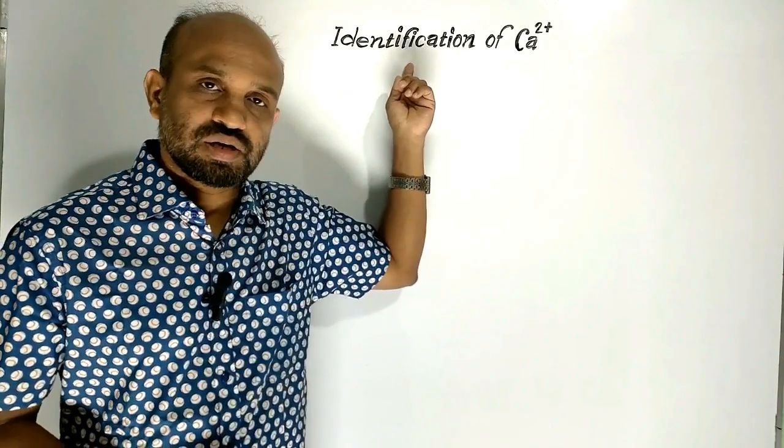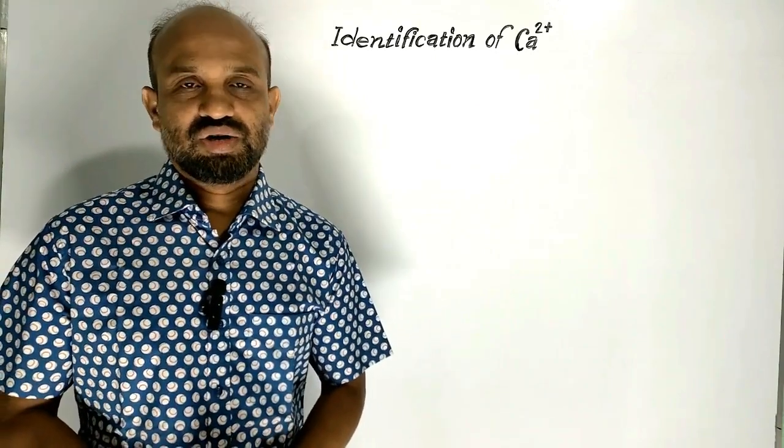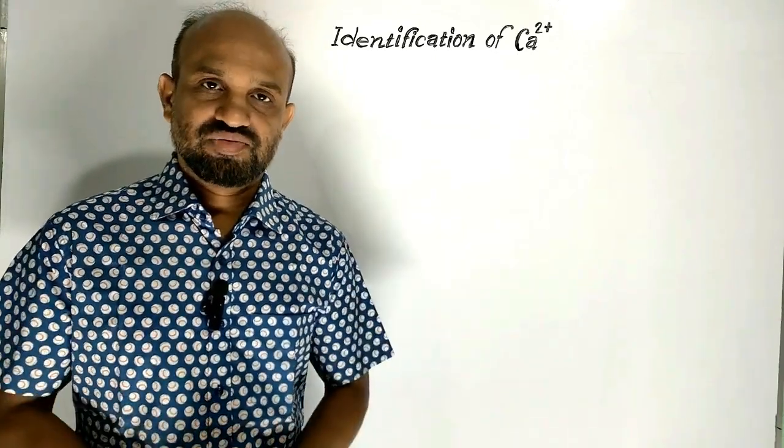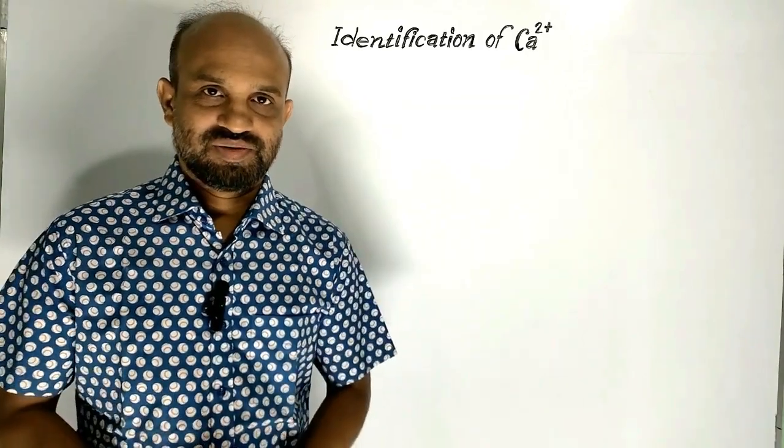Identification of calcium ion. This is today's lesson. In this lesson, we are going to learn how to identify calcium ion in its solution. So let's begin.